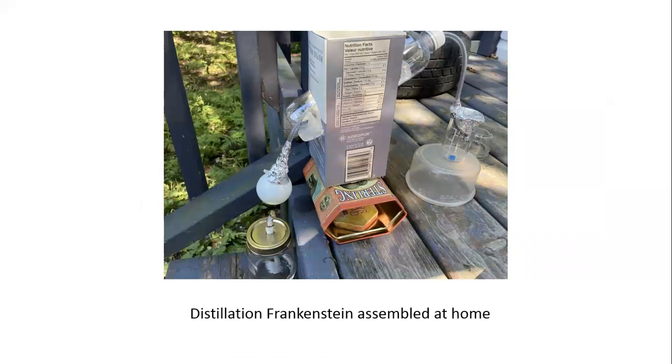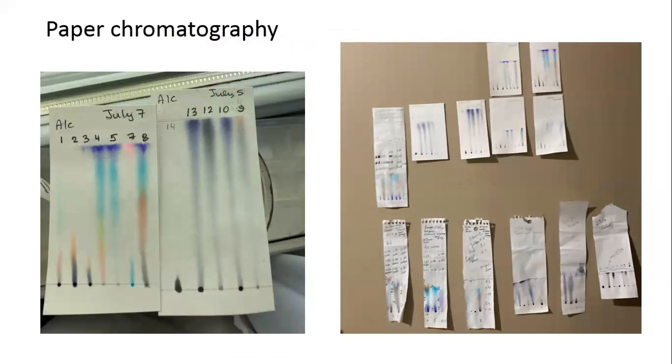So we still did not have access to the lab, and we decided to jump right into creating a database. And oh yeah, paper chromatography, sorry about that. After we got the preliminary solubility tests and all the solvents, paper chromatography was performed with a lot of trial and error, as you can see on the picture on the right-hand side. Choosing the right paper was definitely a problem, but at the end of the day, we got the chromatography results, and as you can see, the spot separation is good, and these plates can later be used in our later analysis.